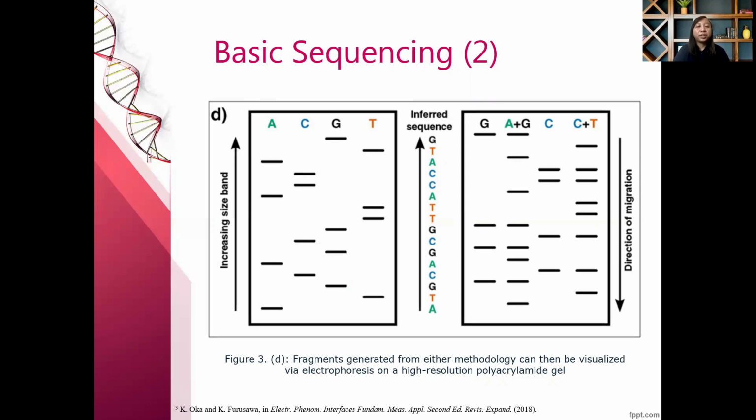An electrophoretic system consists of two electrodes of opposite charge connected by a conducting medium called an electrolyte. The separation effect of the ionic particles results from differences in their velocity, which is the product of the particle mobility and the field strength.